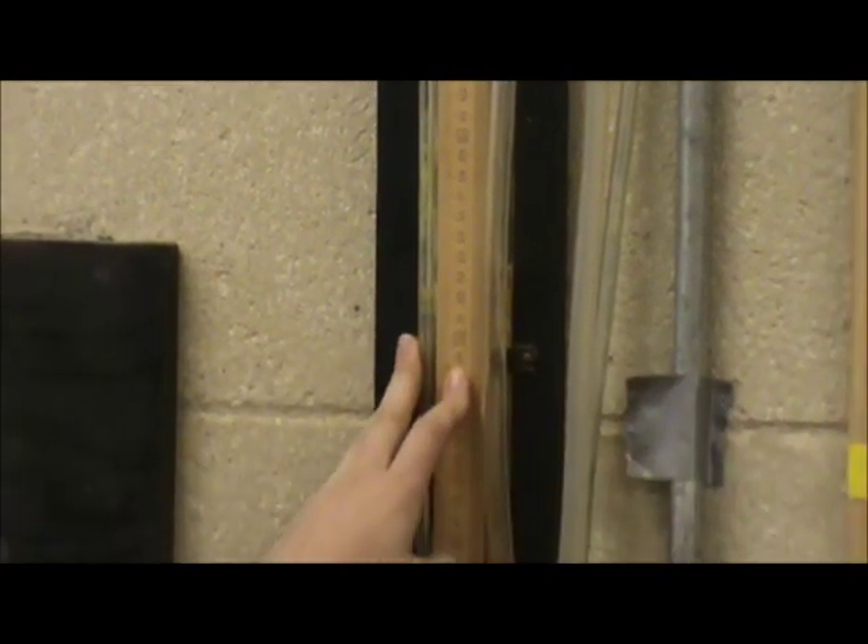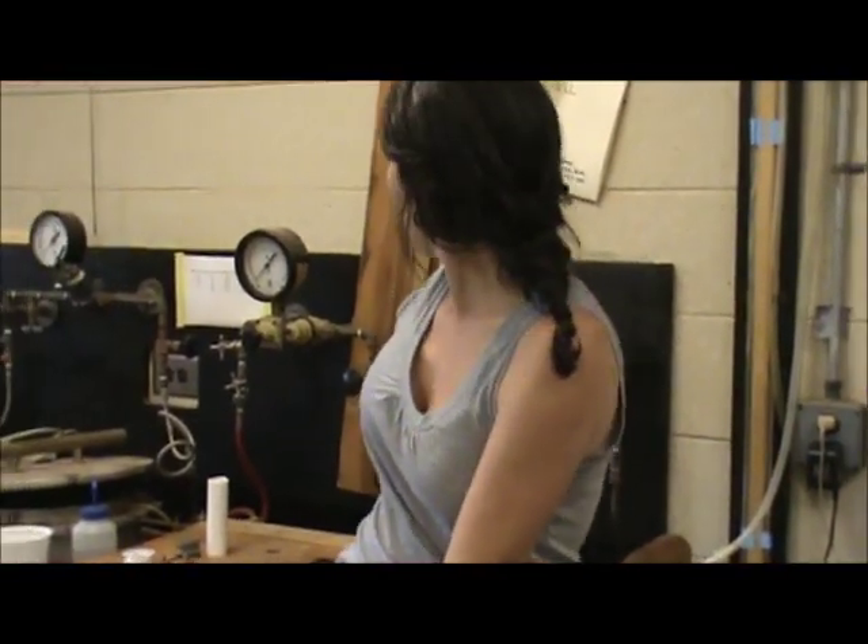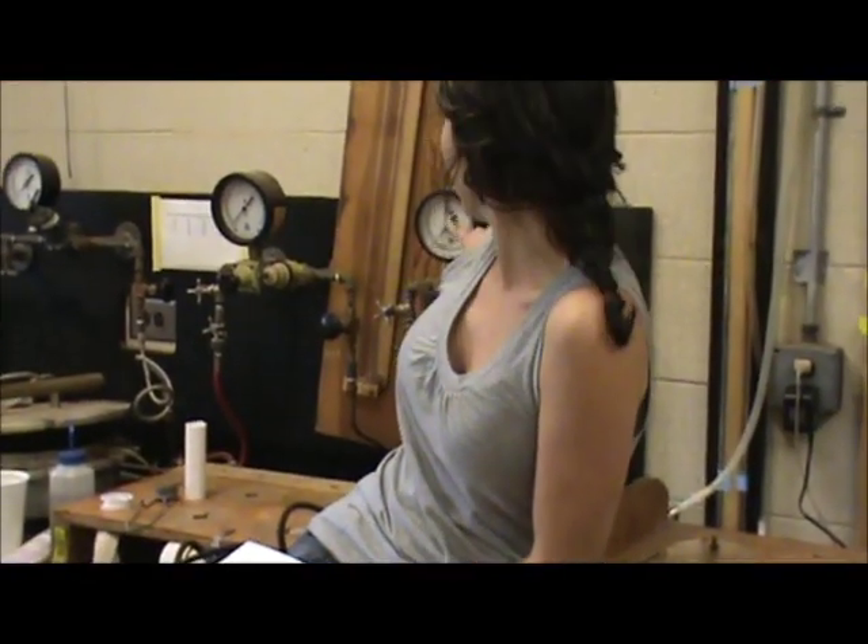We'll do the exact same thing — take the weights until we have a stable weight. Then for the last two settings, 0.33 bar and 0.75 bar, we're going to move over and do the pressure readings from this gauge.